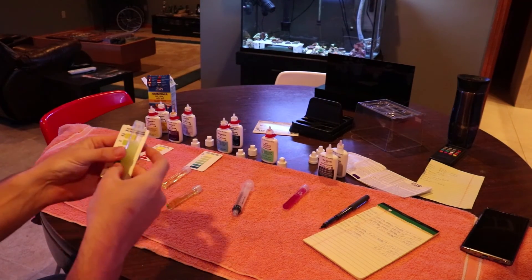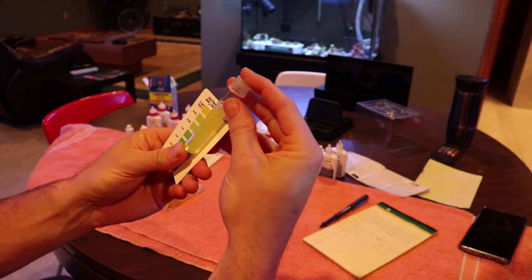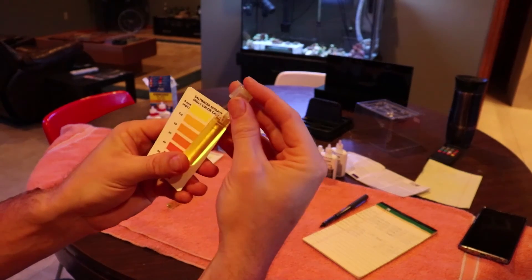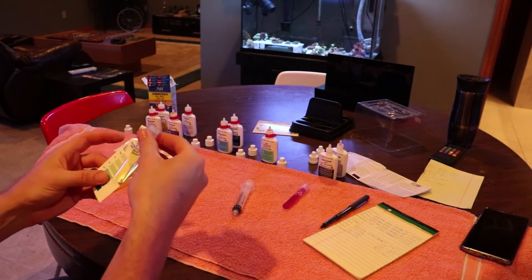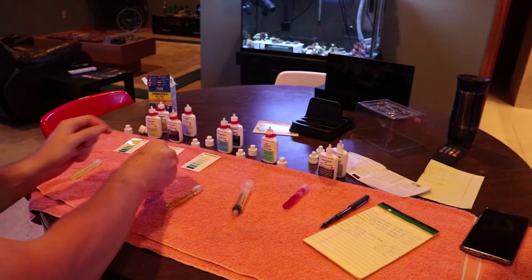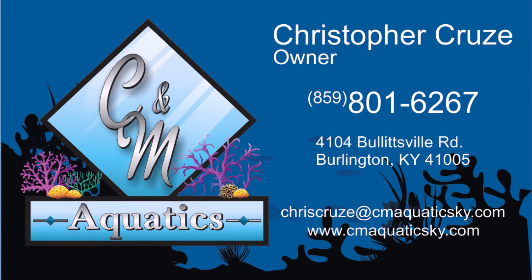It's not as important to have a particular number as it is to have a stable system. That's key. After five minutes you just take your color card and you're going to match the color of the water in the vial to the card. All these were fine. My ammonia, nitrate, and phosphate were all zero parts per million or very, very low. So that's pretty much it for this video. If you have any questions, give me an email, let me know, leave your comments below, and I'll see you on the next one. Thanks, bye bye.